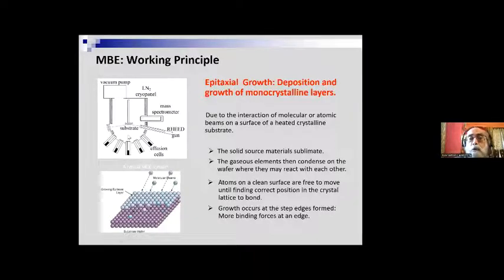And the entire machine is a computer controlled setup, and we are making the epitaxial growth, layer by layer growth. This is important to understand. This is a layer by atomic layer growth. It's an extremely controlled method of deposition of thin films in a multilayered structure or a superlattice structure or a quantum well structure, simply by an epitaxial method, by layer growth. What is happening? The vaporization is so controlled, with such a small evaporation rate, that every individual atom takes some time to settle down on the substrate, and then the second atom is coming. So basically, it's a soft landing of the atoms or the molecules on the substrate, and the substrate is revolving, rotating.